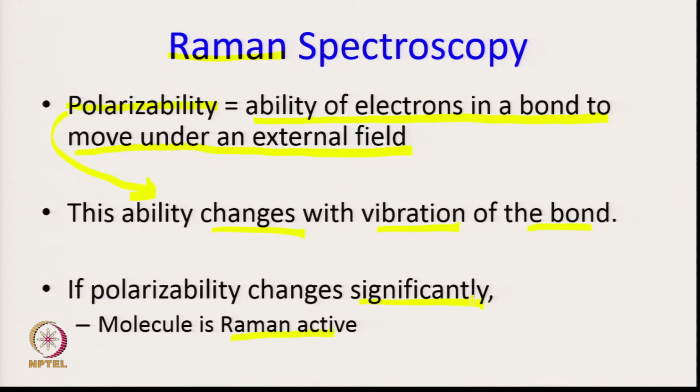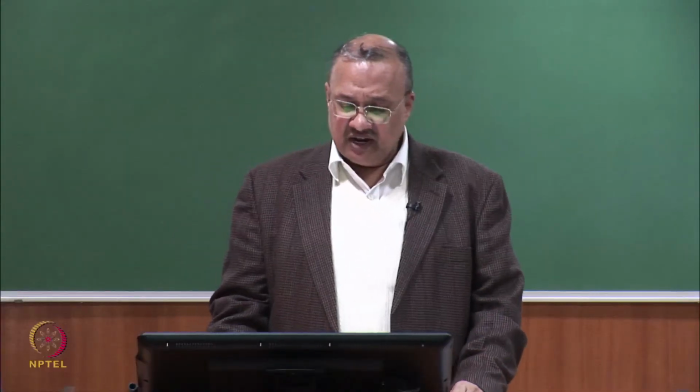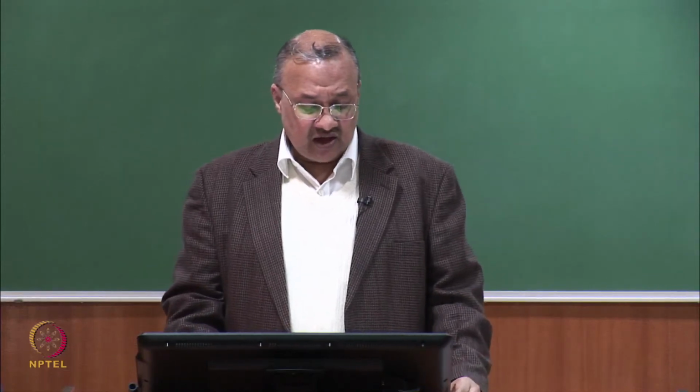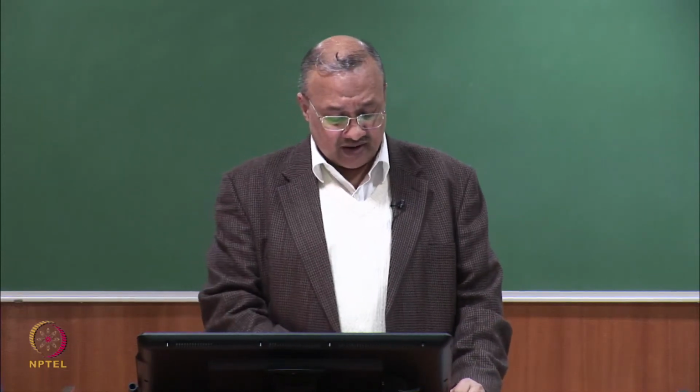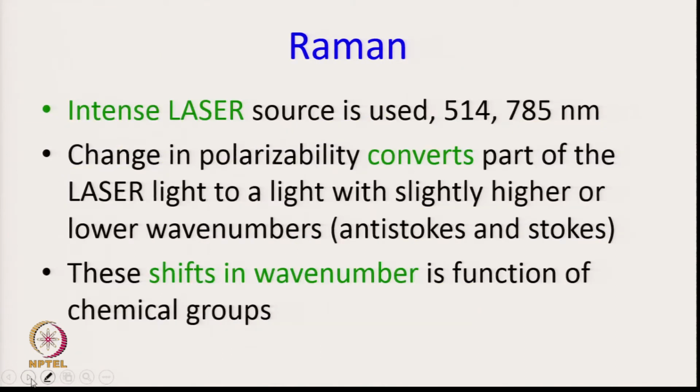Why am I saying it is a significant change? Because small changes will be weakly Raman active, and you may not be able to detect them. And why the signals are weak, we will come to that in the next slide, or maybe slides subsequent to that. So, let us go to the next slide and see more information.